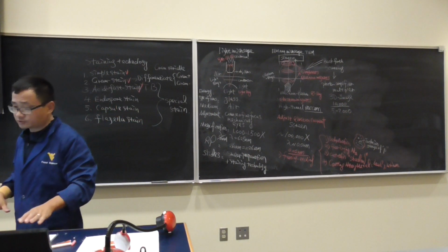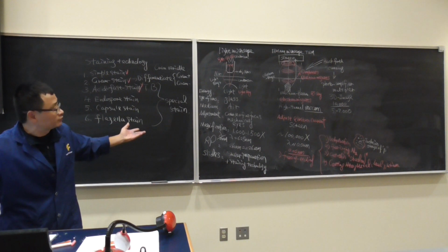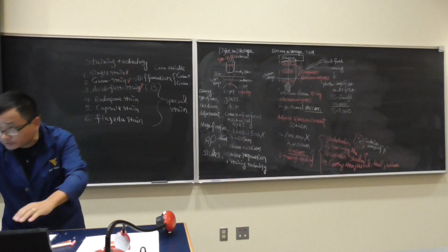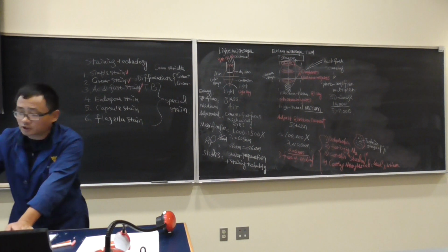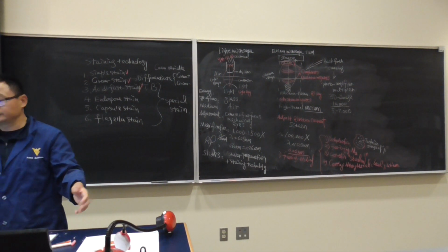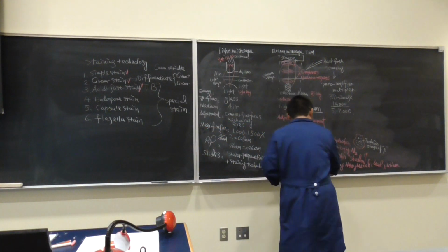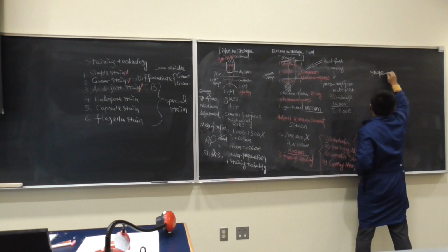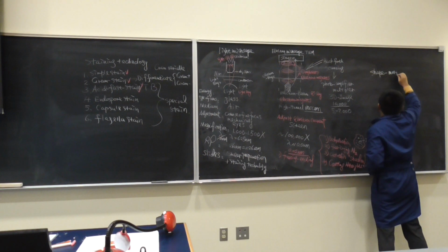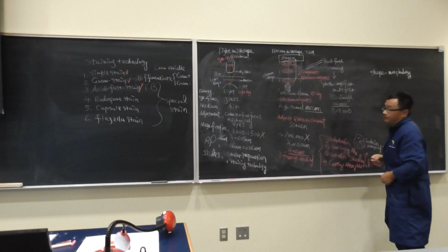Okay, so that's the description of the comparison between the light field microscope and the electron microscope. Now, last thing, we will just be using the slides to talk about the shape of the bacteria. The shape of the bacteria usually means morphology. That is what we care about.